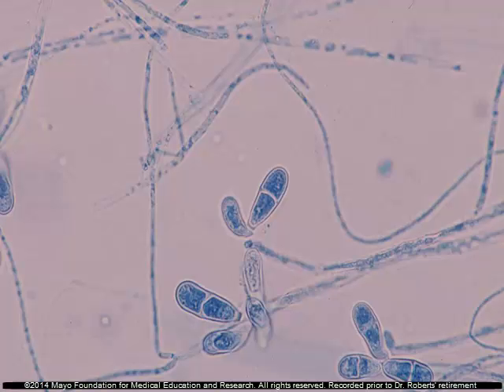The funny thing about mycology, the rule is that if it's something that's really easy to recognize, you don't ever see it. That's one of the problems that we have. But you can see this one. I think if you saw it, you'd know what it looked like because characteristically it has the two cells.